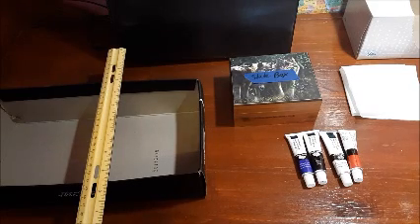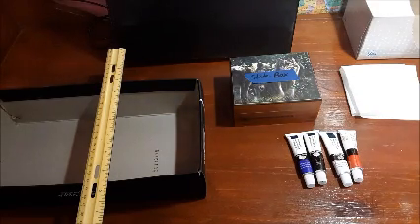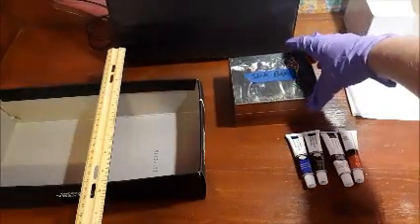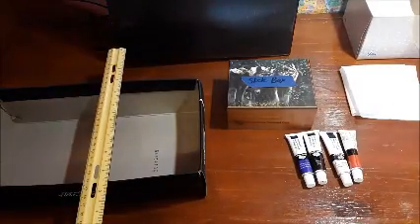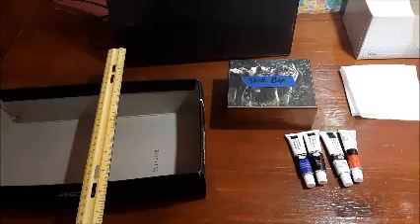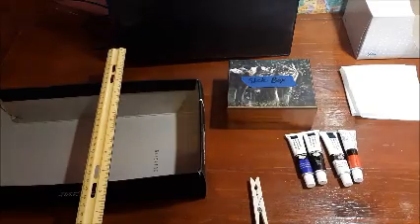And then, of course, if you were in a real lab, you would go and gather your materials, which I already have set out right now. So, of course, you have your heat fix slides, which are in the slide box right now. I know you can't see it, but there it is. And then you need a stain tray. I don't actually have one, so we're just going to make do. Your slide clip. Sorry, you couldn't really see that from where it was.